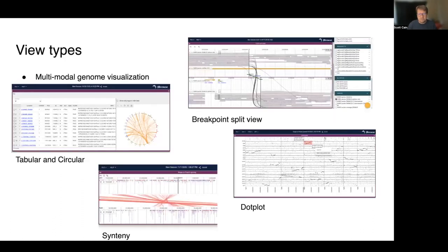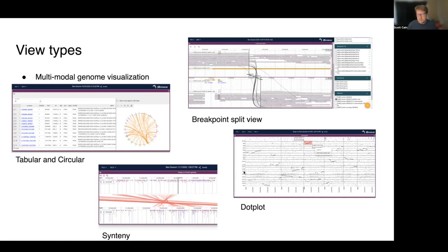I'm not going to spend too much time talking about the tabular, circular, and breakpoint views. They're pretty neat, but they're not the sort of thing we really need at WormBase. But I will be talking about the synteny and dot plot views that we use for comparative genomics. I think we've gotten some good results with that so far.